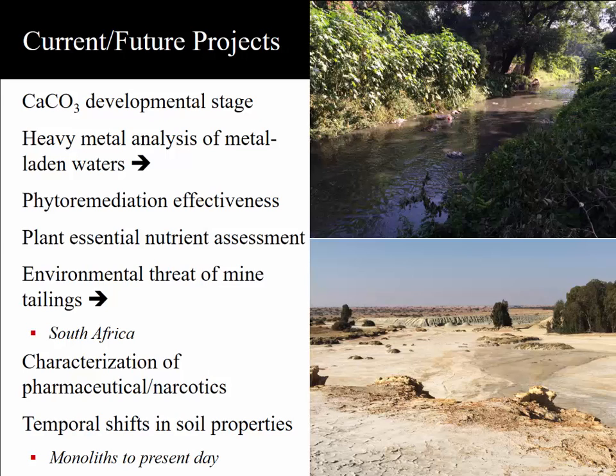And when we crossed Price's Fork Road, just on the other side of Price's Fork Road, we hit a big spike in nickel and zinc. I looked right up the hill and thought pollution was coming from the coal plant. But we found it nowhere further downstream at all, even 15 feet further downstream. We were right next to the road, and so we think this was coming off the car tires on the road. Interesting little exercise that took about 3 hours.